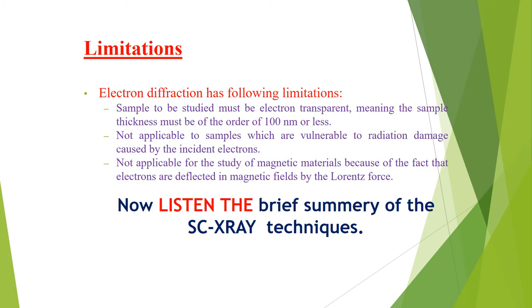Dear student, as we know, we have started this single crystal X-ray diffraction technique from the X-ray sources. We know that X-rays were discovered by the scientist Röntgen, who was awarded the Nobel Prize in Physics for the discovery of X-rays in 1901. And X-rays have a unique ability to penetrate and get diffracted within the interatomic layers of crystals.